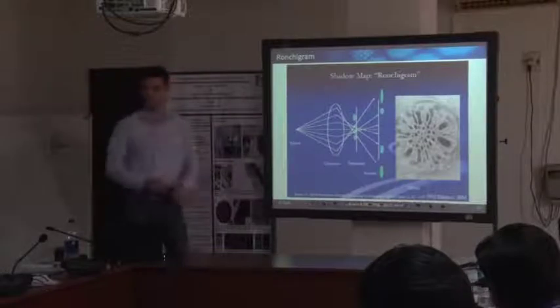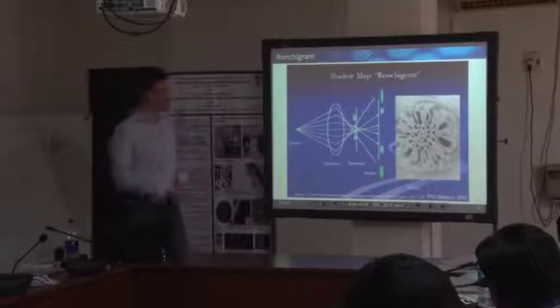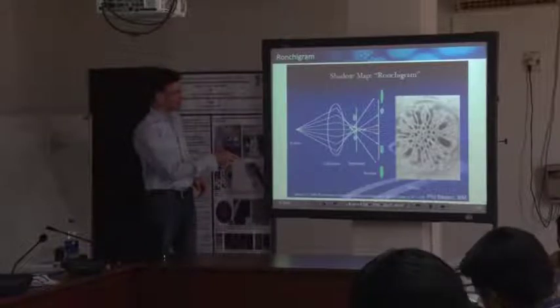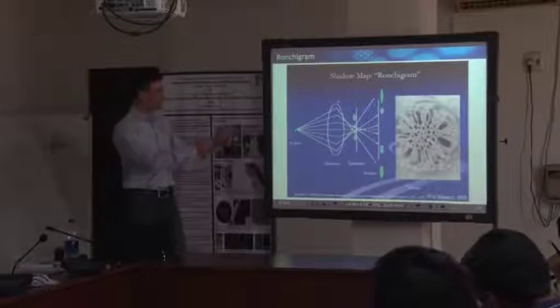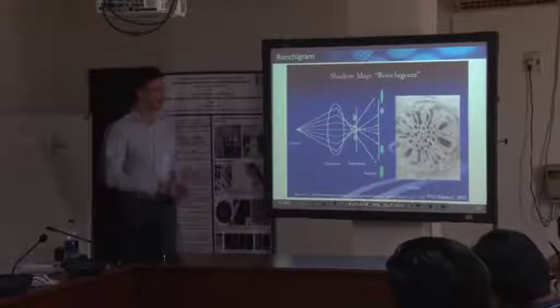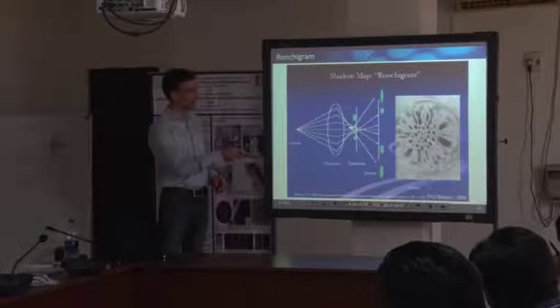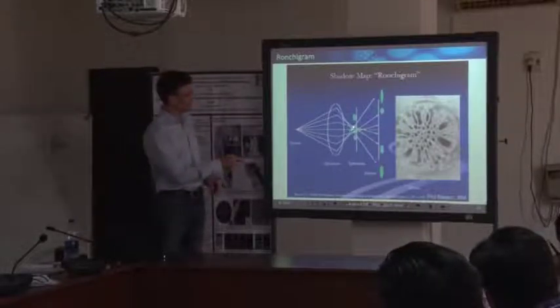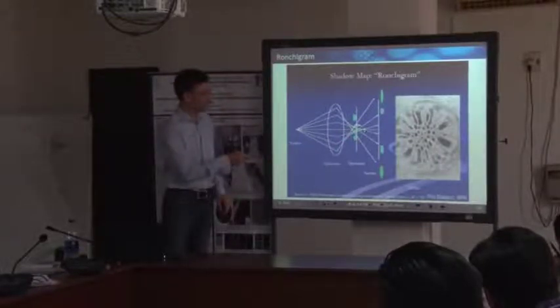And we know that we have spherical aberration. The spherical aberration, in this particular case, means that rays very close to the optical axis, these ones, have a certain focal length, but all these rays far from the optical axis feel a stronger impact by the lens, meaning that the focal length is shorter. And if you now follow all these trajectories of our electrons, then you will see that for these outer rays, this is a slightly defocused probe.